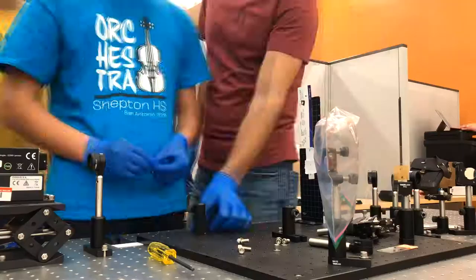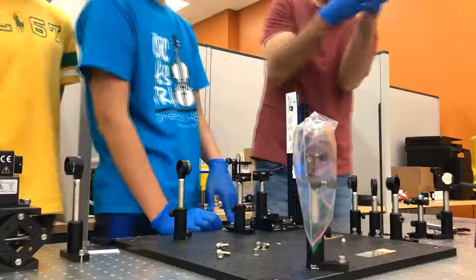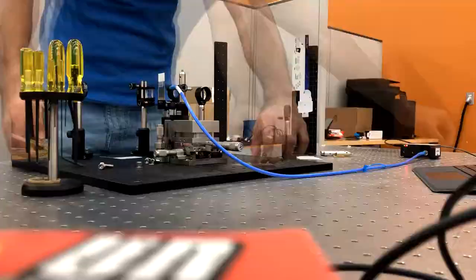Before laser testing, safety goggles were always a must. We used and precisely aligned a series of various optical lenses in order to properly magnify and focus our laser light onto the perovskites. We were then able to gather data and generate graphs from the light being emitted from our samples.